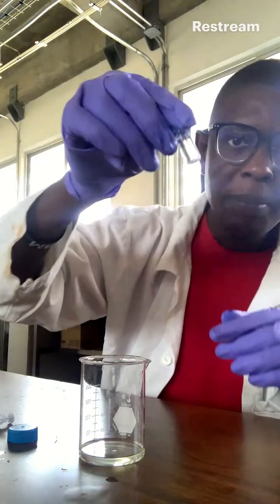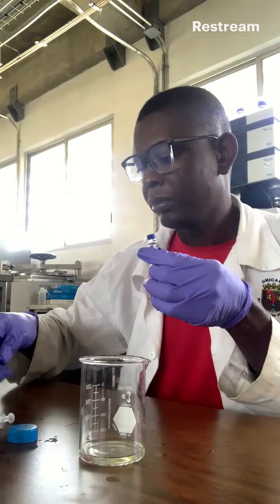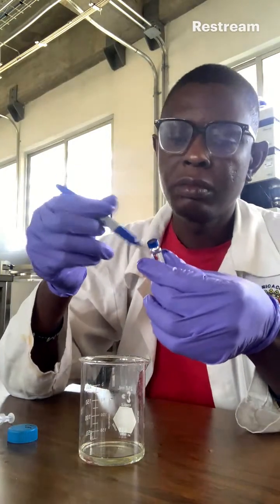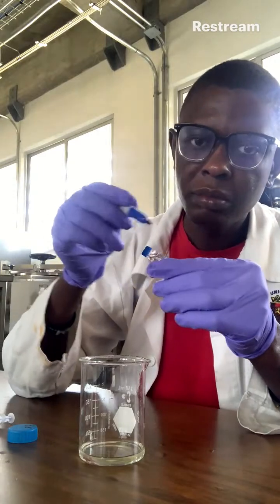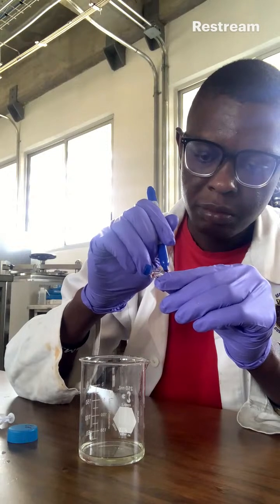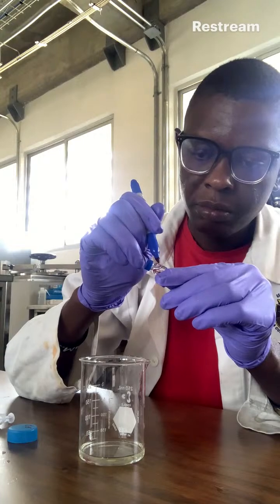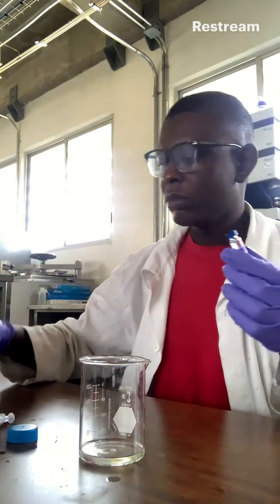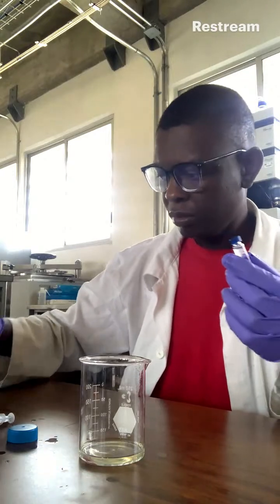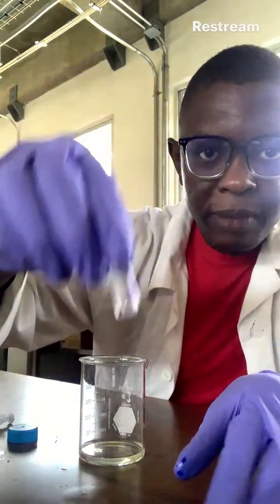So I'm also going to name it blank. So guys, I've prepared 4 of my samples.